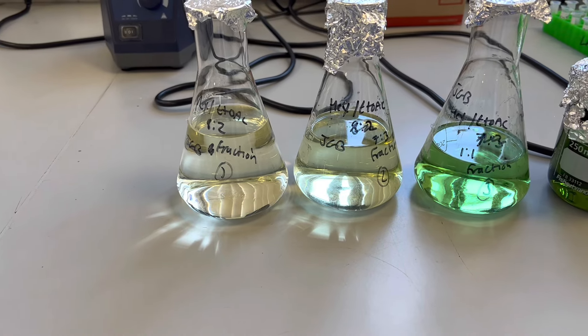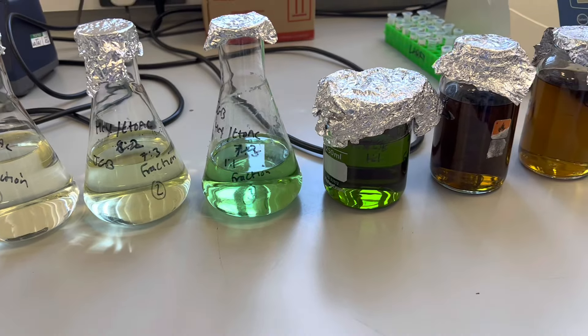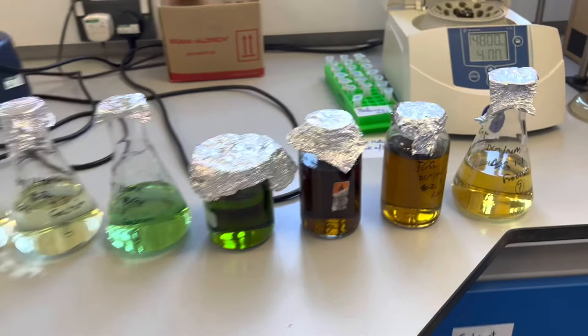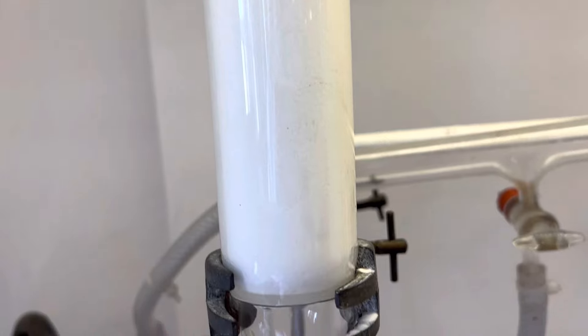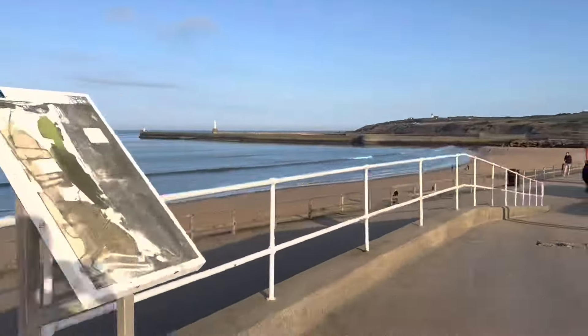After a while I managed to figure it out and we got the column going — look at these lovely bands! Ignore the packing at the top, it's horrible. And here is the final result: I managed to collect all of my fractions in all different colors ranging from green to orange to yellow, and I'm very pleased with how it turned out. After finishing in the lab I went down to the beach for a run since it was a lovely day, and smashed a 4.5 kilometer run!